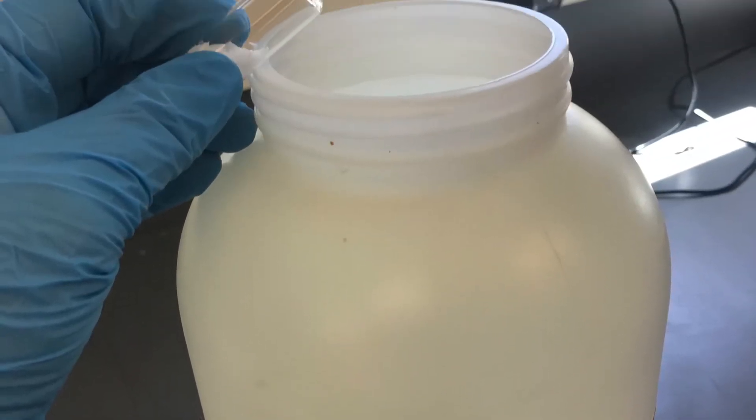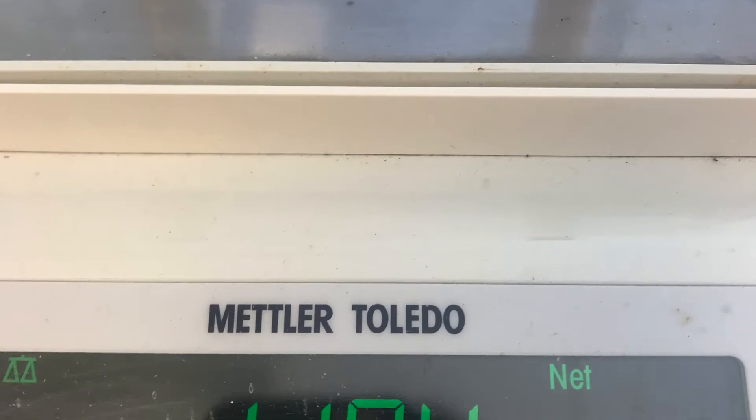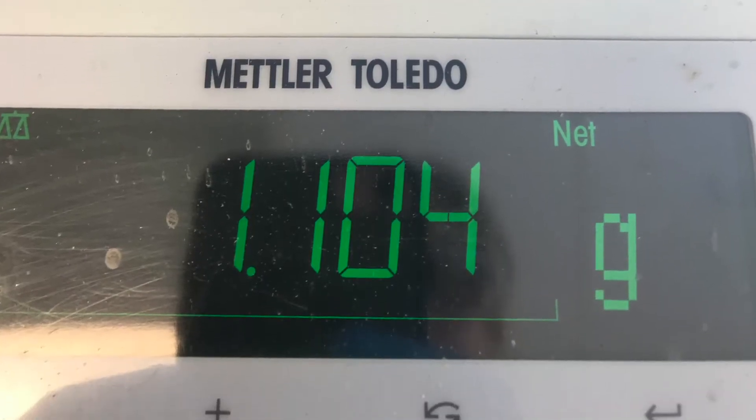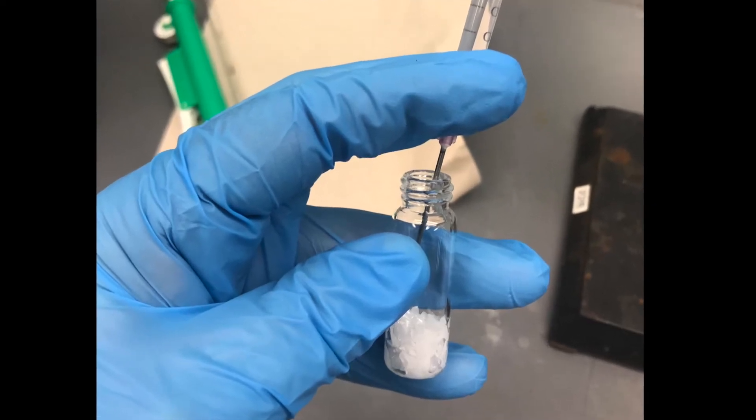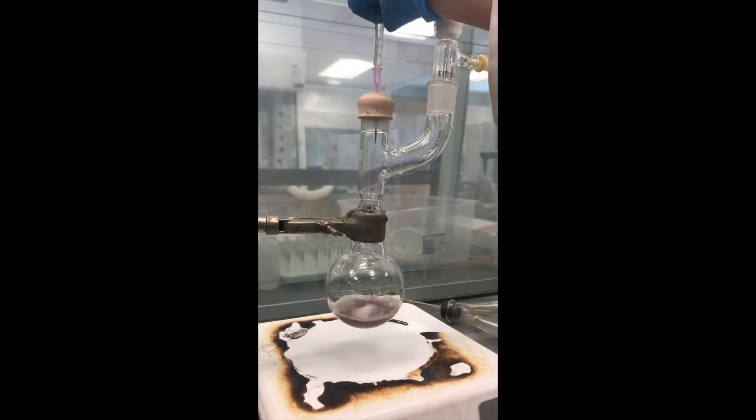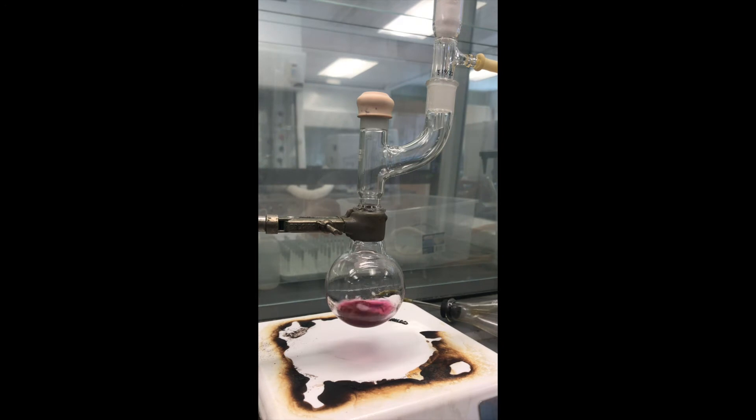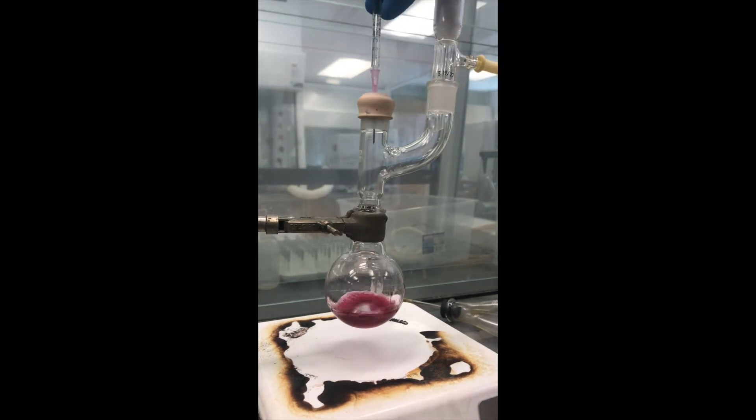The ketone that we will be using in this reaction is benzophenone. And we are going to take 1.09 grams of benzophenone and mix that with 2 milliliters of anhydrous diethyl ether. Using a syringe, I added the benzophenone ether mixture to my reaction and then monitored the reaction over the next 15 minutes.